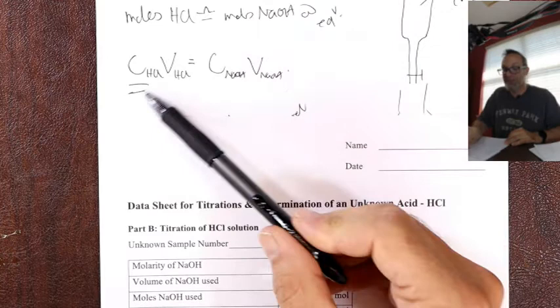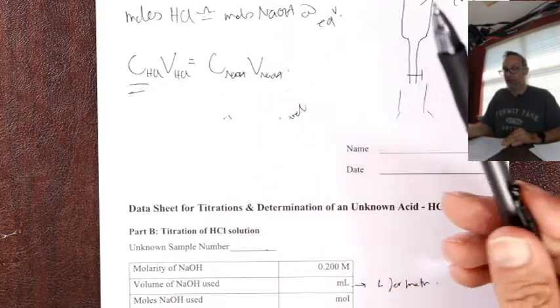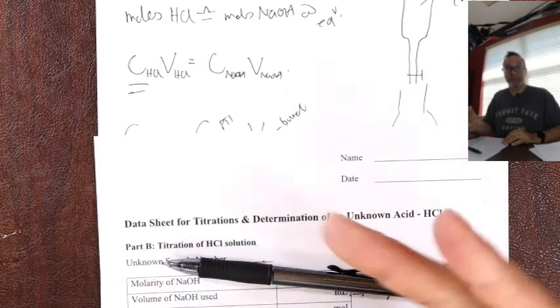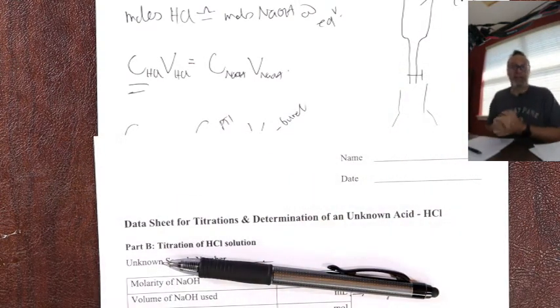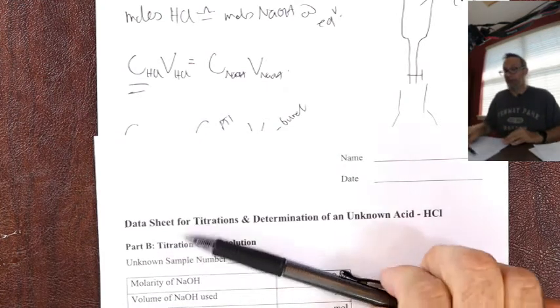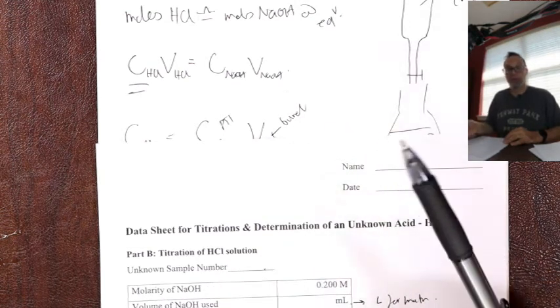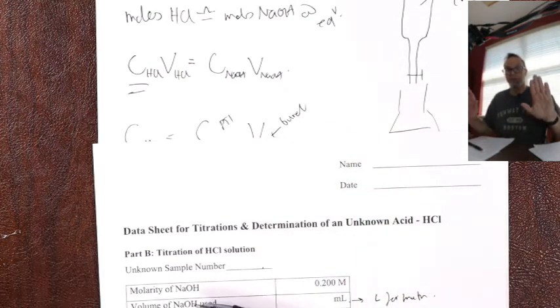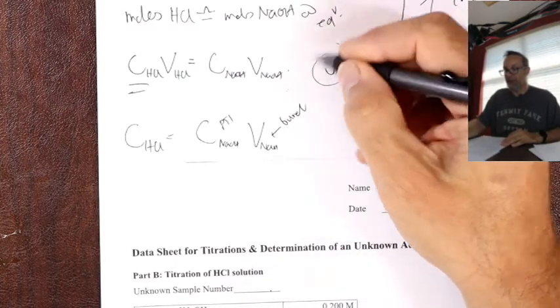Do that, right? So CV equals CV for 2 aqueous solutions during a titration, okay? If we had something that was dibasic, where the balancing numbers weren't 1-to-1, then we do slides and ladders, okay? Because when you have non-1-to-1 equivalents, the math gets a bit more complicated. We'll talk about that in a couple of packets' time, but for now, it's all 1-to-1. The first one with KHP, 1-to-1, right? This one, 1-to-1. So 1 mole equals 1 mole, CV equals CV, we're good. This is okay to use.